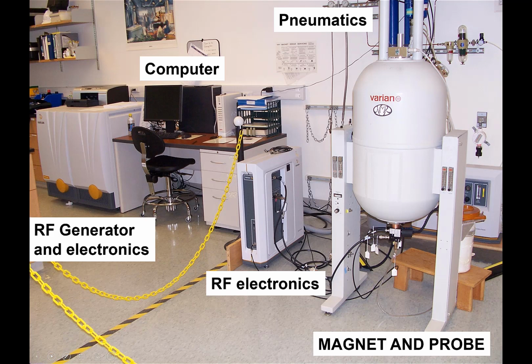There's a tube at the top. We blow air up and we set the sample on there, and then we release the air and it slowly drops down and then we spin it around. So that's our 300 megahertz.